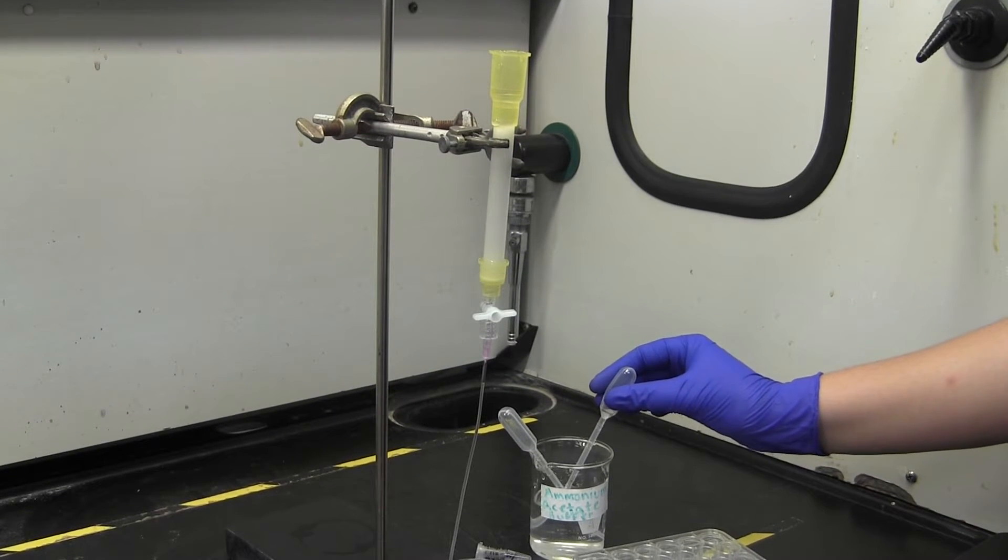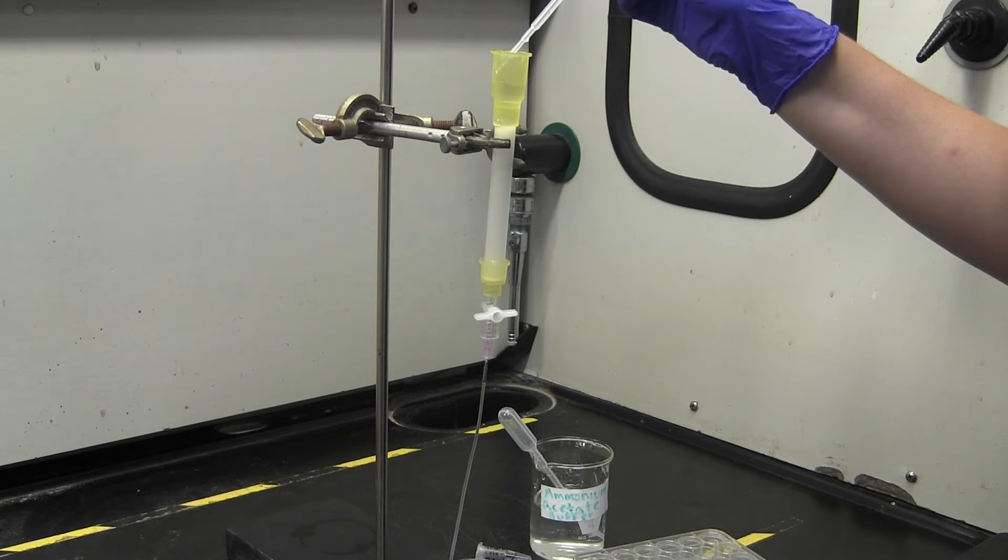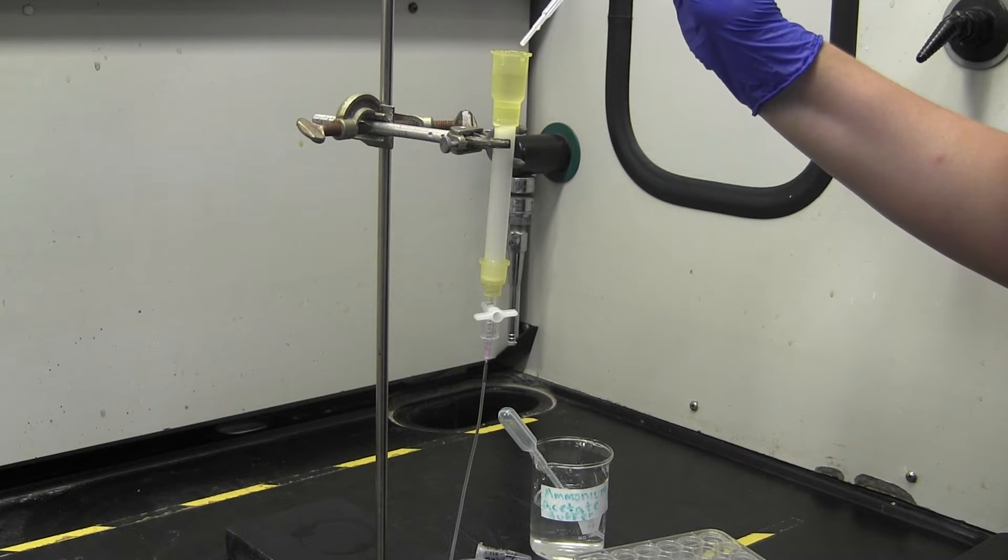Begin by running about 10 milliliters of your buffer through the column to make sure that it is clean. Do not worry about the intervals between the drops at this point.